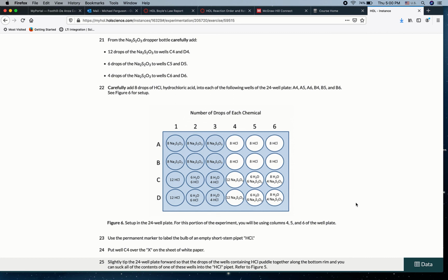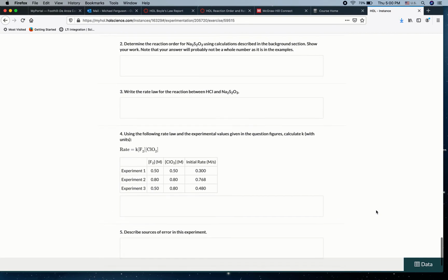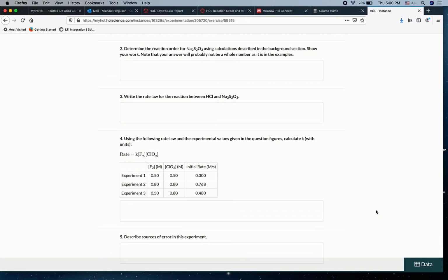But please do be careful with this one because of the hydrochloric acid, and make sure that you're properly covered, especially your eyes. Hydrochloric acid can hurt your skin, and like I said, watch out for other people. Don't do this where you eat food as well. So pick a different area of your home to work for this one. Okay, but please let me know if there's any issues.